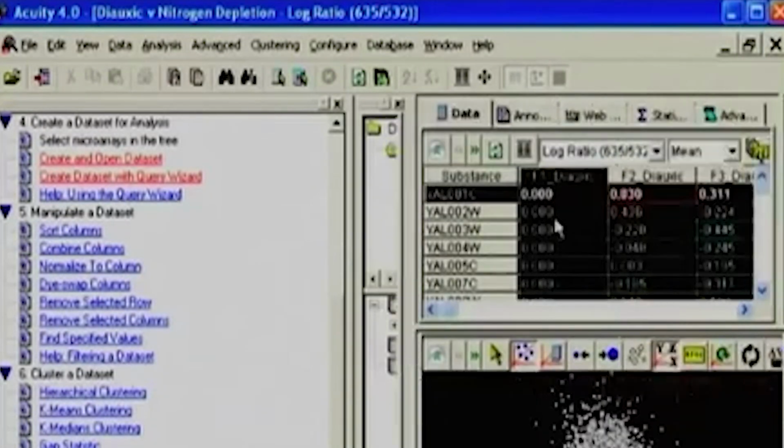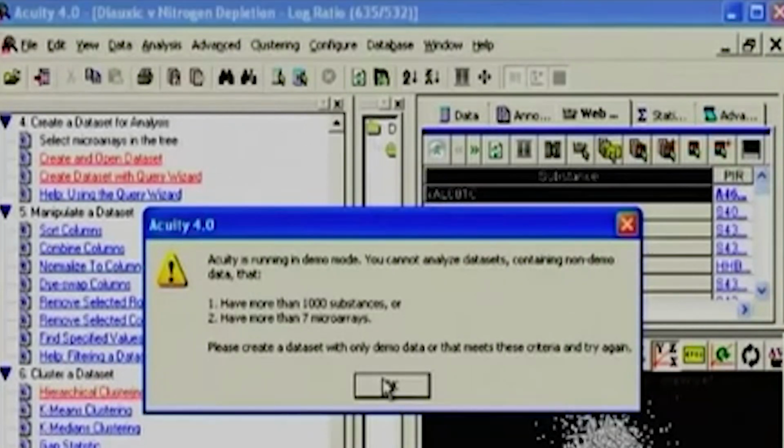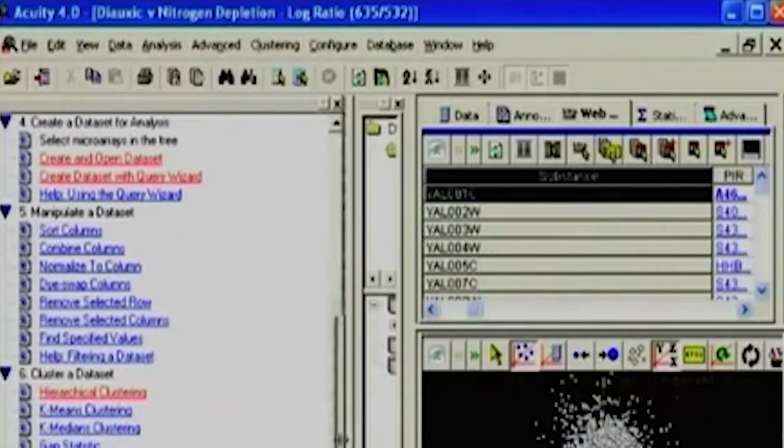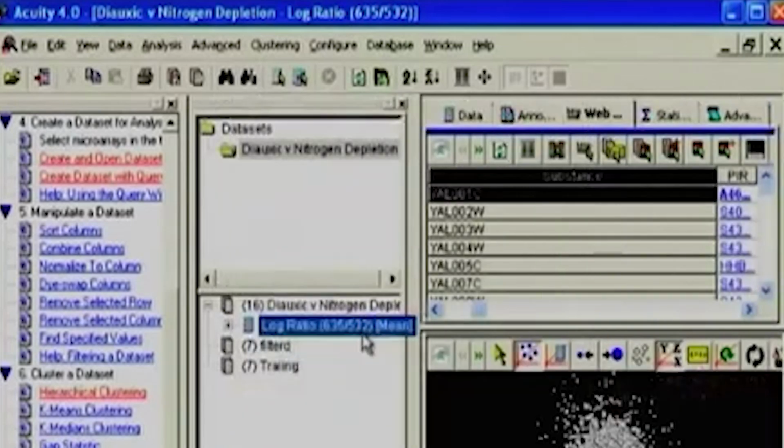And another important thing is, whichever is bluish in color, that particular one you have selected to work with. So this is filtered data that is allowed to work with. And when I hit a clustering possibility, it says you need to create a quick data set. The meaning of that is you have half the data already in hand, but now what you need to do is look at a third tab which allows one to look in the form in which you want to create the data set you want to analyze.